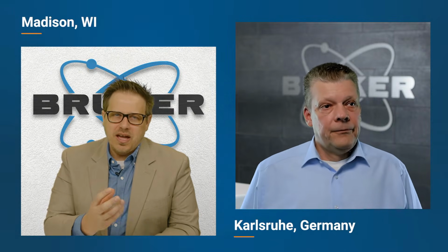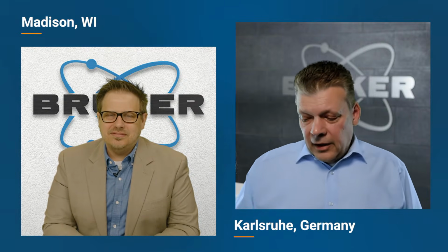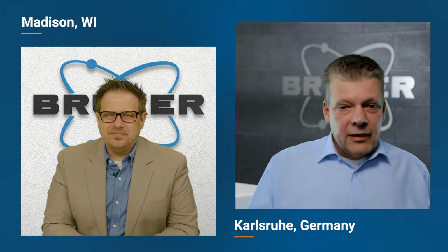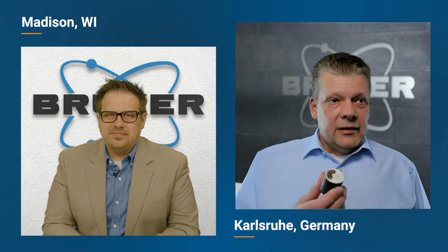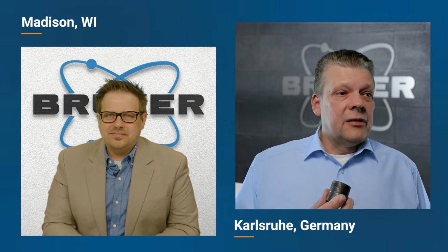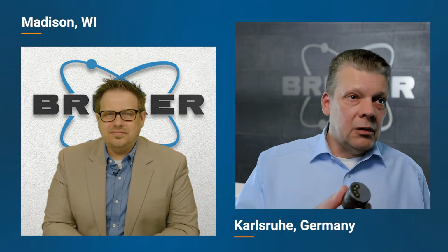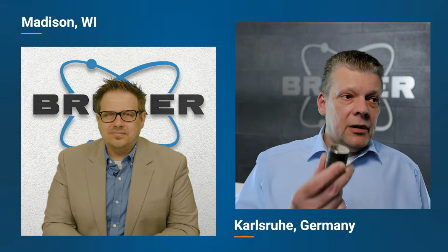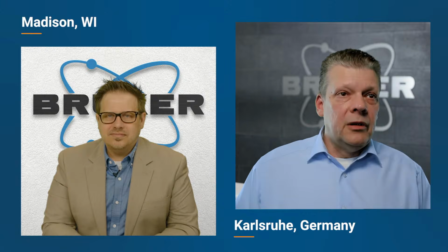Okay. So now let's focus a little bit on that sample. You mentioned that we're actually going to spark the sample, so I'd imagine it has some requirements on the type of samples that can be used. Yeah, it has requirements, and because the excitation source, the spark, has something to do with electricity, the sample must be electrically conductive, and it must be massive. So a powder or liquid will usually not work. It must be a rather massive, conductive material.